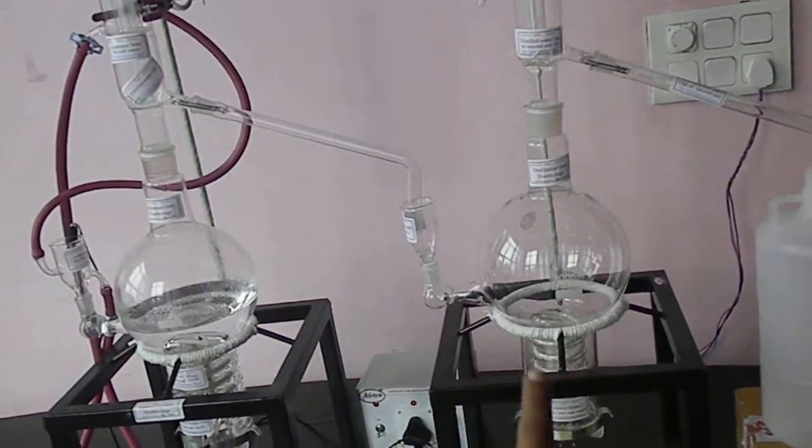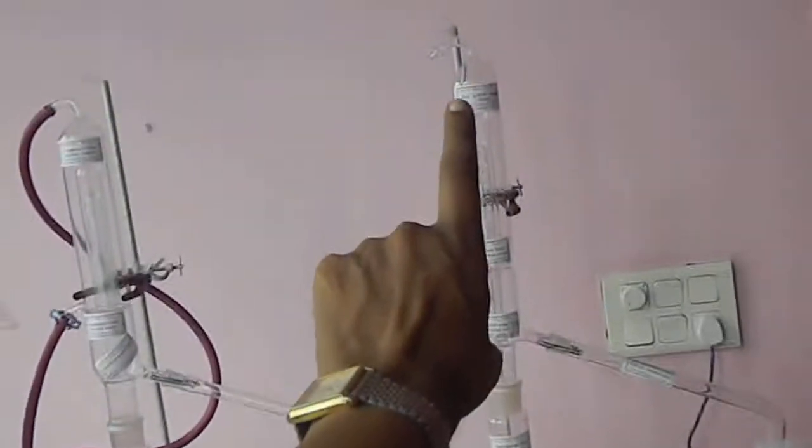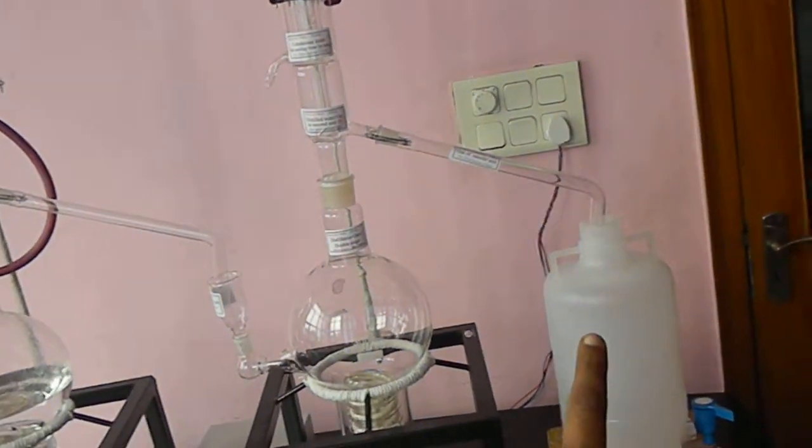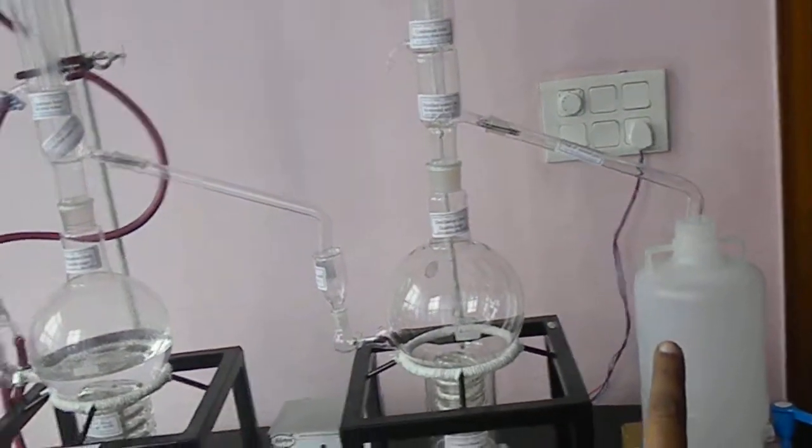This will fill in this chamber. Second distillation will distill the water and again come to the second section. And this will go to the usable flask to collect the water.